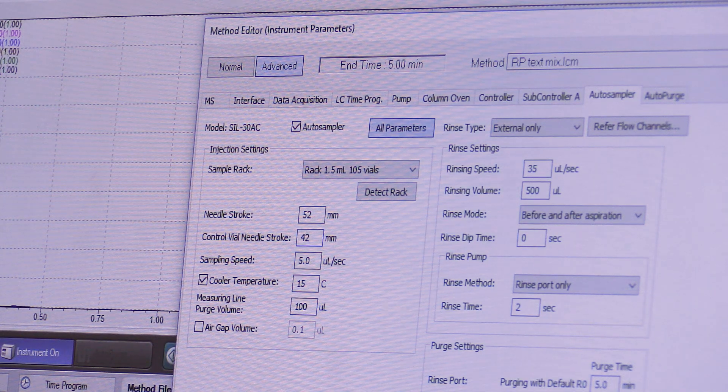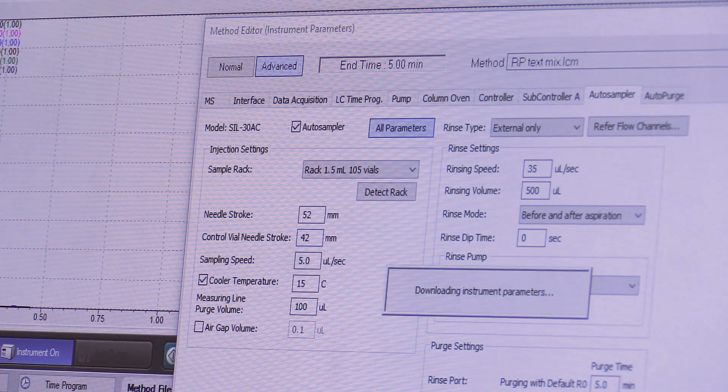Also, avoiding sample diluent mismatch can tremendously help mitigate sample crash or precipitation. Sometimes, adjusting the needle insertion depth to make sure that the injector is drawing from the supernatant of the sample can also help prevent particulates from entering the column.